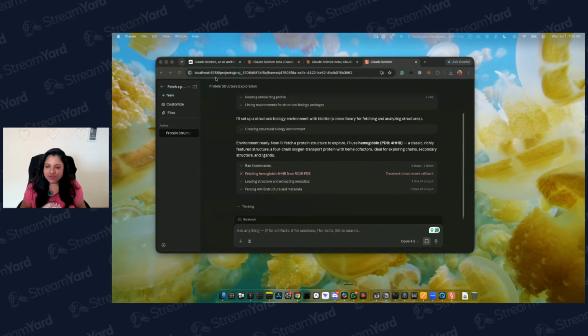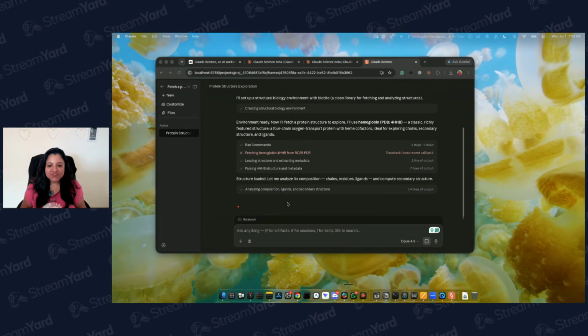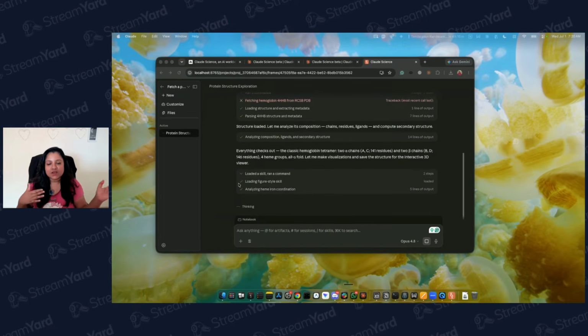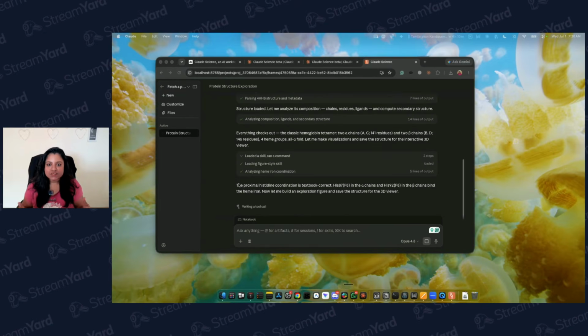As you can see, it runs on your local host. So it's not like your data is going out. I mean, technically it is because it still uses Claude, the cloud models. So basically, the API call goes to Claude and then gives you the answer based on the results from there. But I think whatever you generate, or whatever sensitive information you upload, is not stored anywhere, is what I meant.